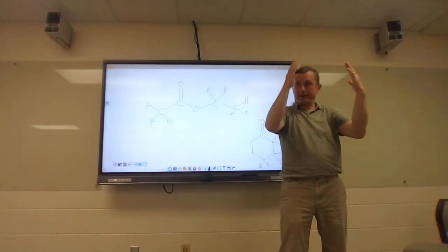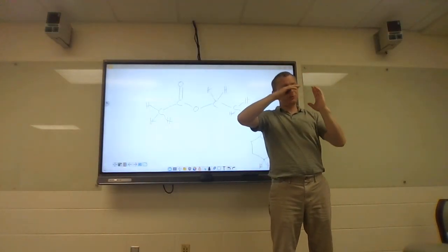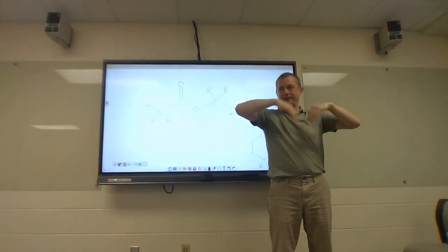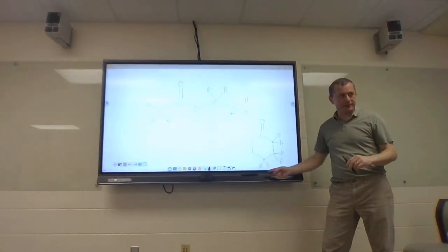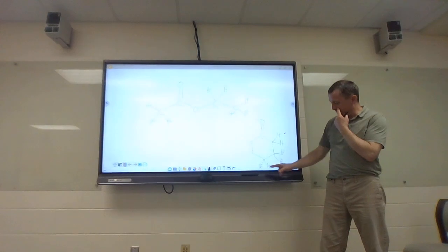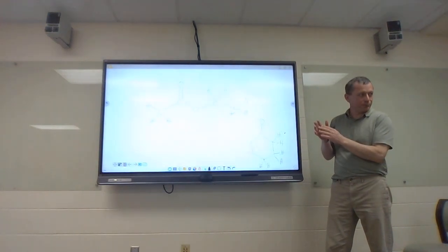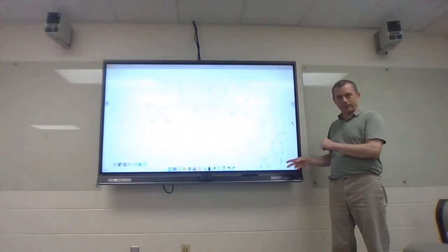It's doing this rapidly in the NMR. And so those protons that are axial and equatorial are changing rapidly between the two. It's much more pronounced for these guys down here than these. And since these two are different than those two, it does not work as n plus 1. It's making a triplet of triplets.